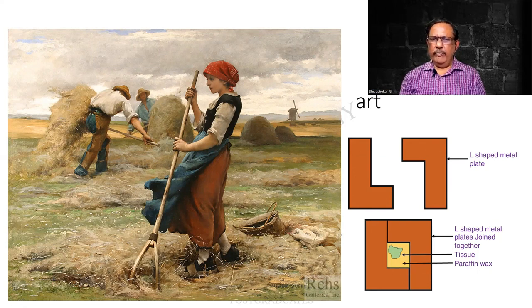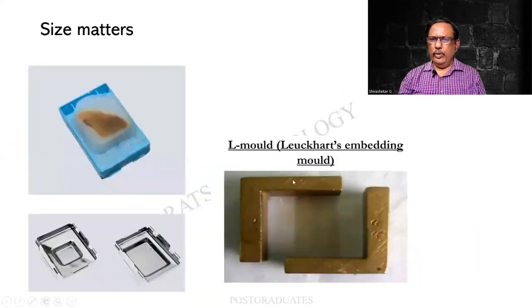The wax gets solidified and these L pieces can be separated. The wax becomes solid. It is fixed onto the block holder. This is a beautiful one. And personally, I feel this has taught us a lot. And look at this fellow over here.